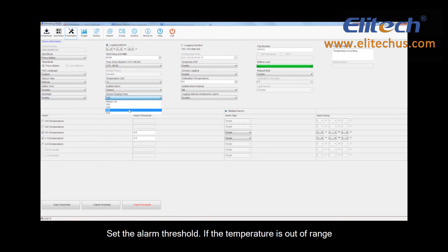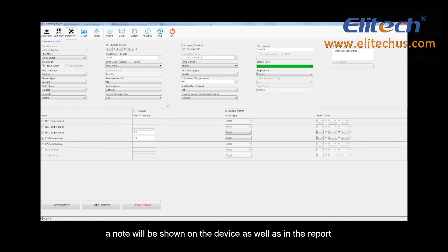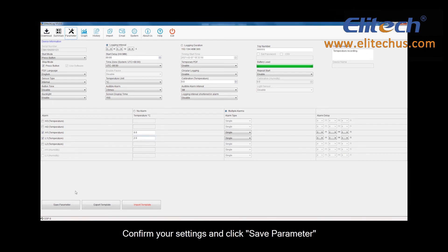Set the alarm threshold. If the temperature is out of range, a note will be shown on the device as well as in the report. Confirm your settings and click Save Parameter.